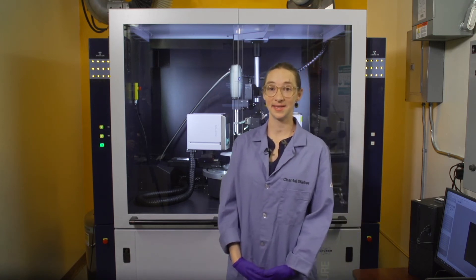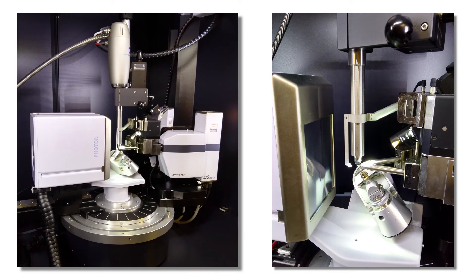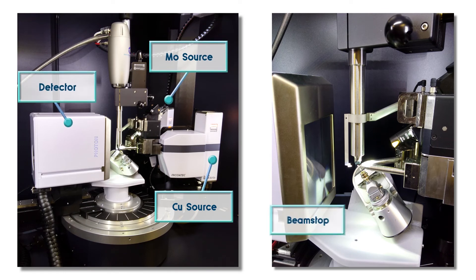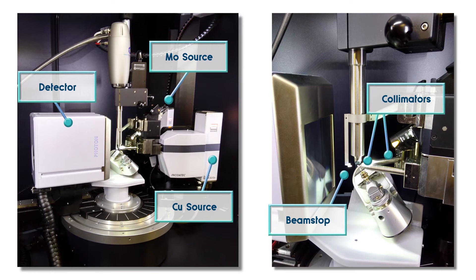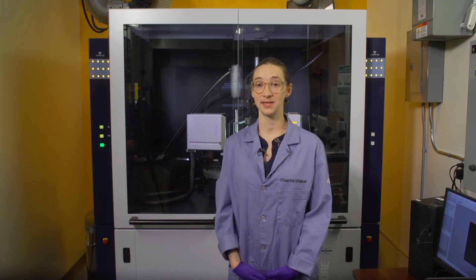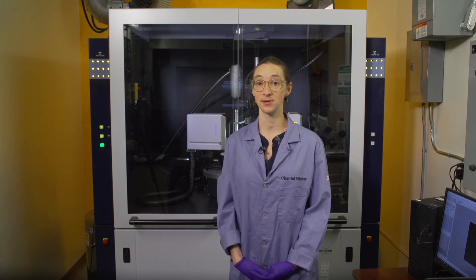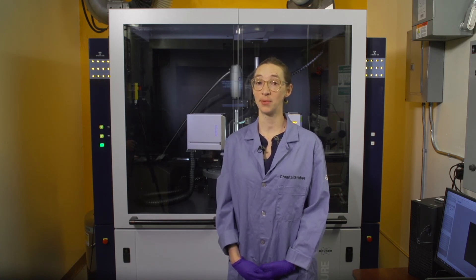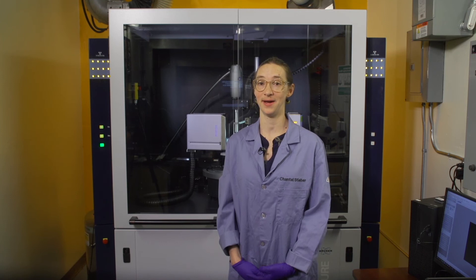Now we are ready to examine the diffractometer itself. This picture highlights general instrument components including copper source, molybdenum source, detector, beam stops, collimators, cryostream, and goniometer. When the instrument is under normal operating conditions, there is minimal risk to the user. However, regular monitoring is critical and it is important to be properly trained to be able to identify when there is a problem and to know what the risks are.